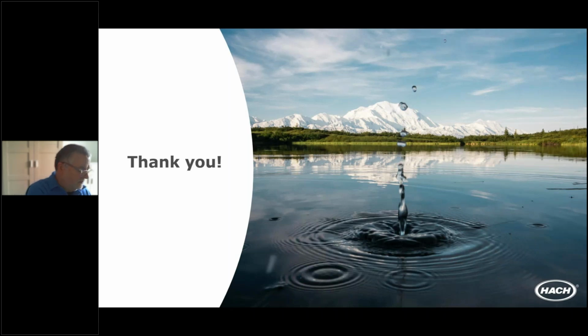So I got another one, Philippe. Is it possible to measure sulfates? Yes, I wanted to check. Yes, we have sulfate.